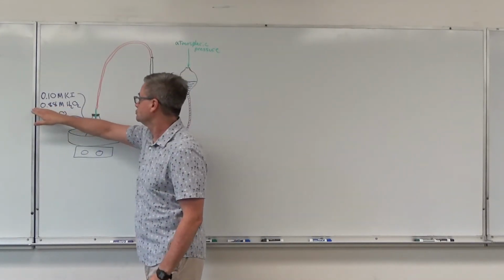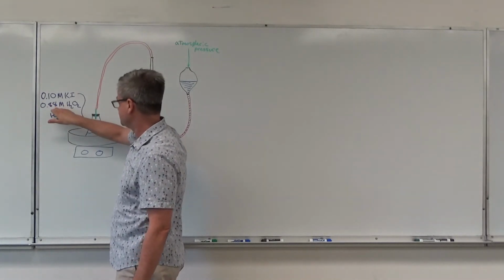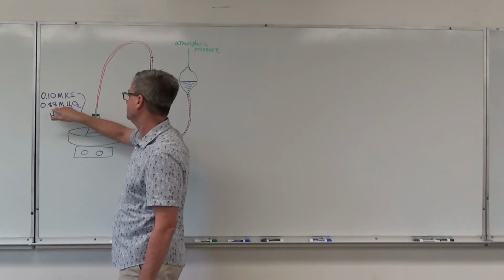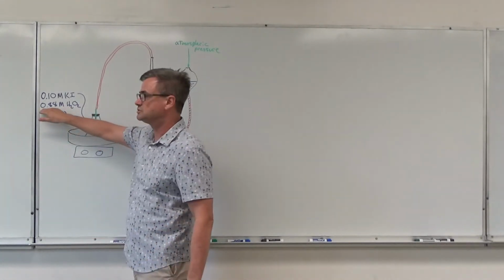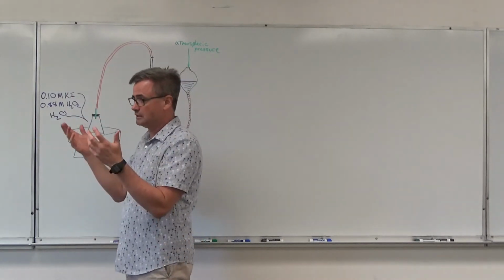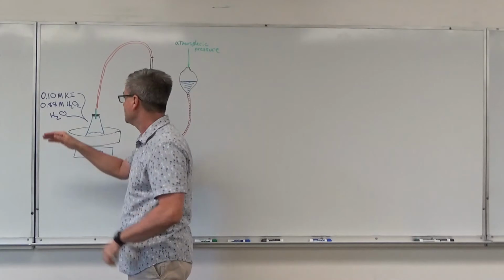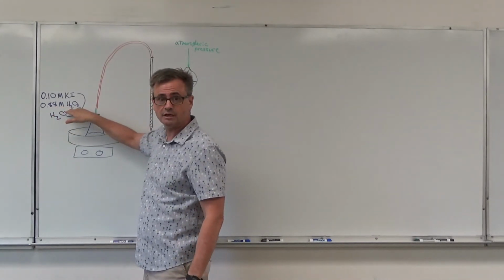You're using a specific volume of this hydrogen peroxide solution, so you can figure out the moles. At some point I think we use 10 mL, I forget now actually, but if we use 10 milliliters, that's 0.01 liters, and you can figure out how many moles of hydrogen peroxide you have.